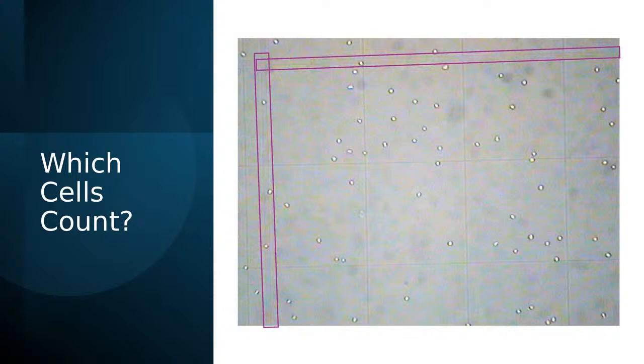And so the cells, remember, are these kind of like shiny spots that are glowing back at us, not the darker splotches on the slide. And I can tell based on how some of the other lines keep continuing, I believe in this hemocytometer, I am on the lower right-hand side.